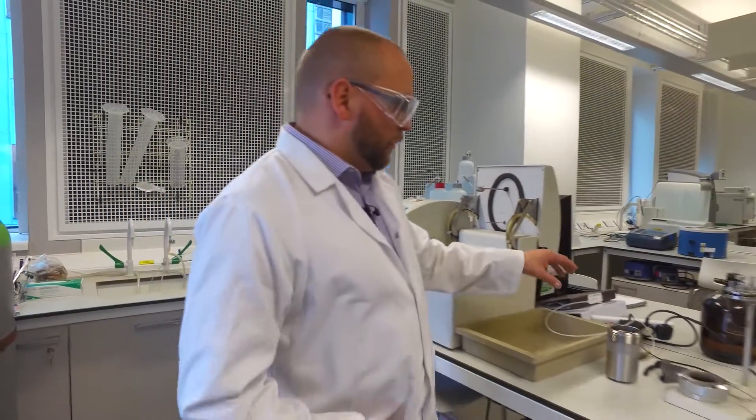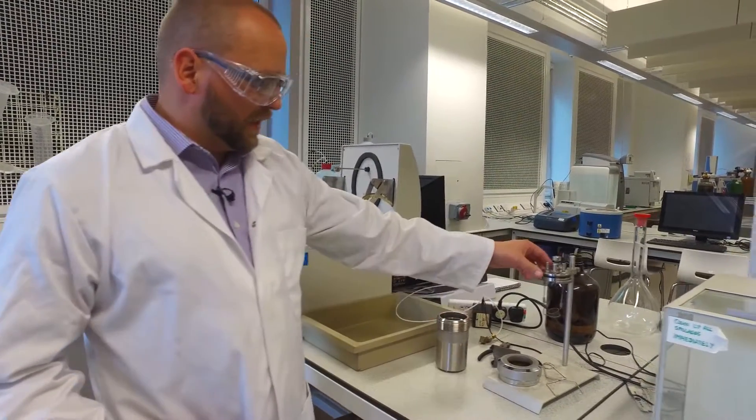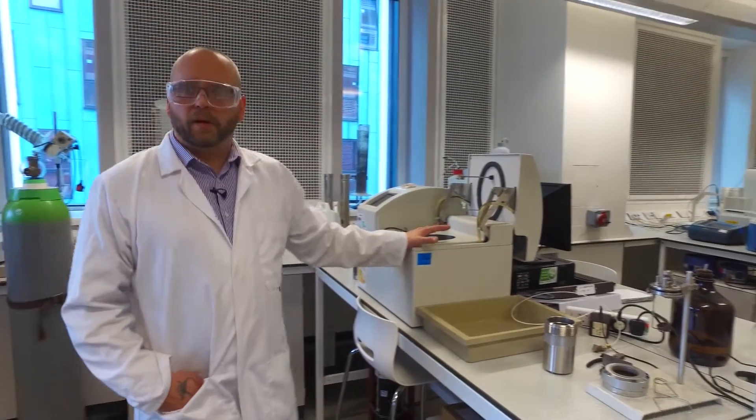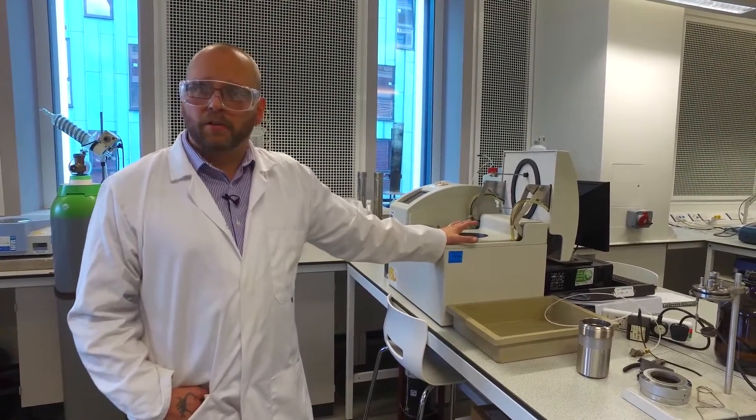With your sample placed in here and once it's set up, you'll be determining the enthalpy content of a fuel, so how much heat can you generate from it.